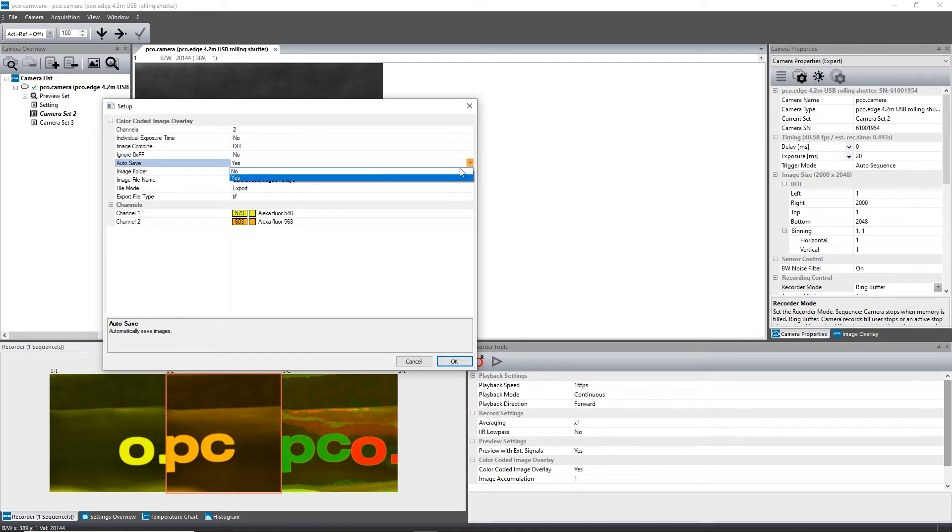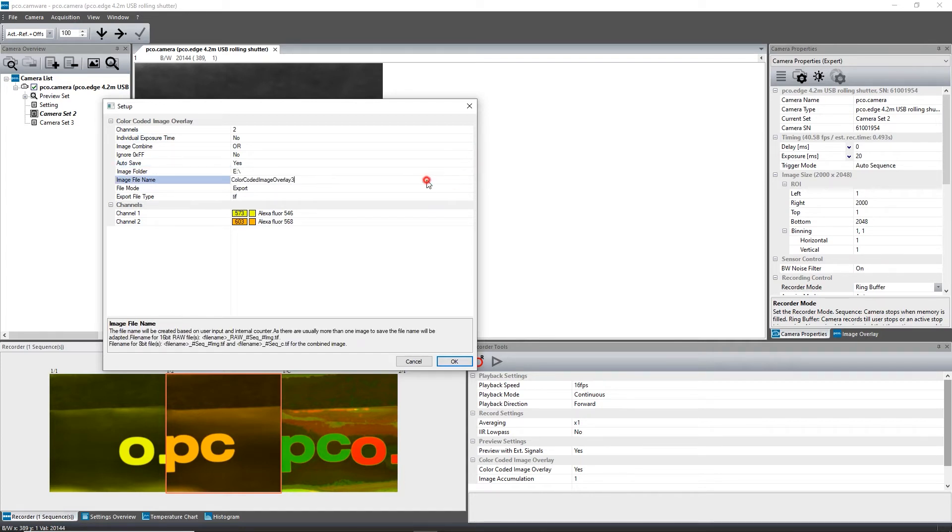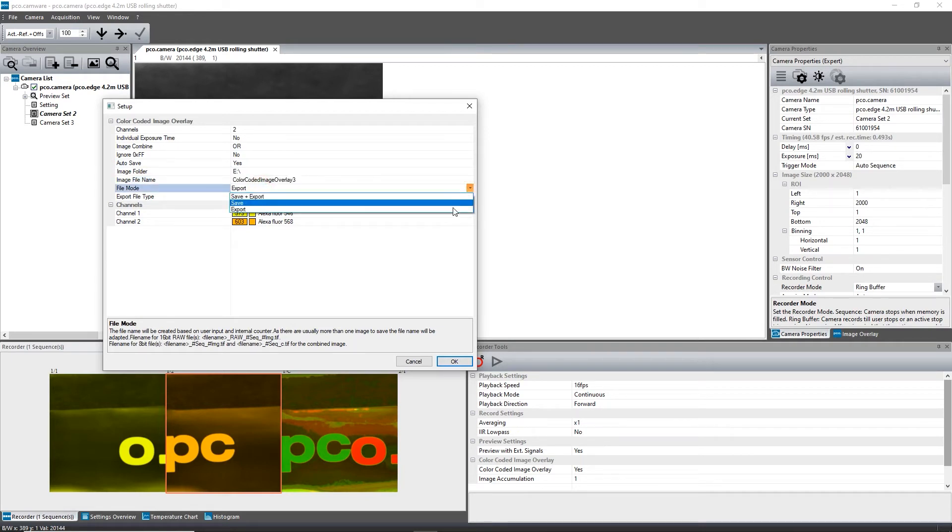To do this, enter your file name and specify the image folder. Select if you want to export or save, and which data format you prefer.